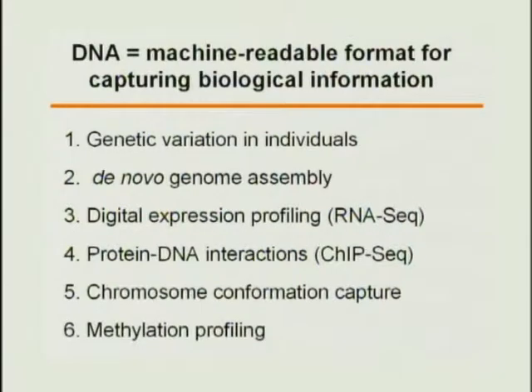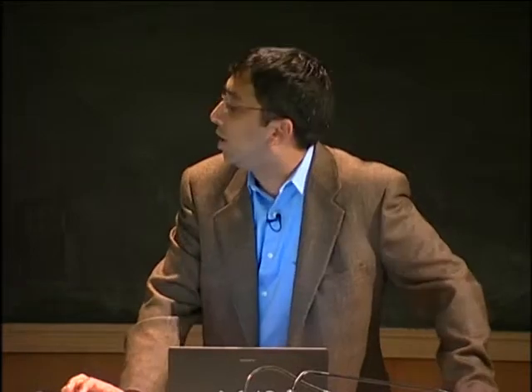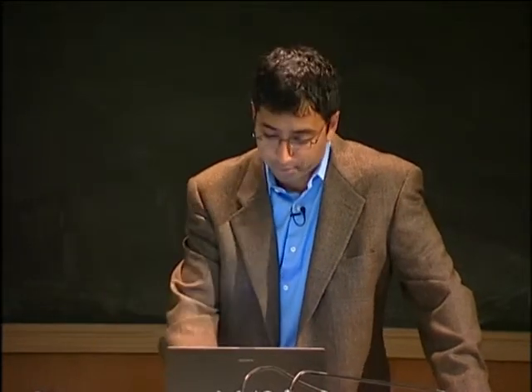So not just sequence of genomes, but also transcriptomes, looking at RNA expression, looking at protein-DNA interactions, looking at chromosome conformation, looking at methylation, and the list goes on in terms of the various kinds of biological information that people have found ways to translate into sequence data that can then be captured on the same instrument, right?